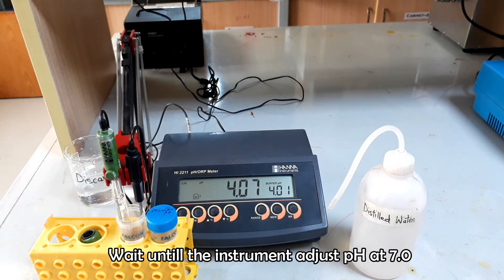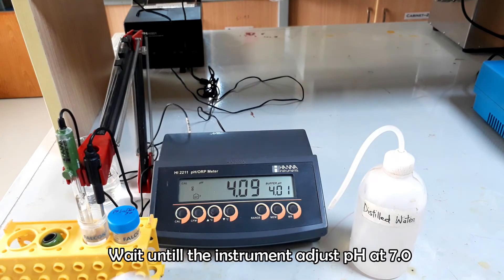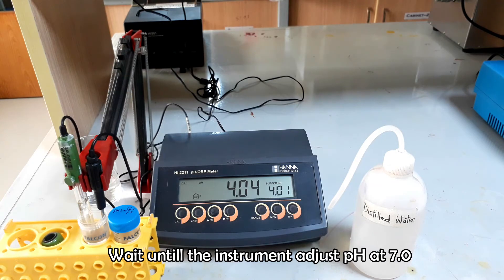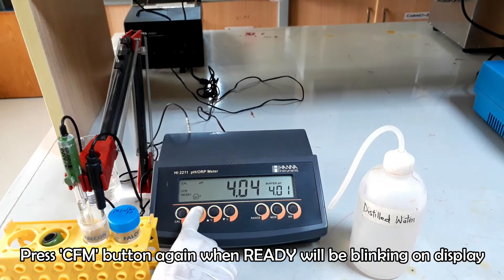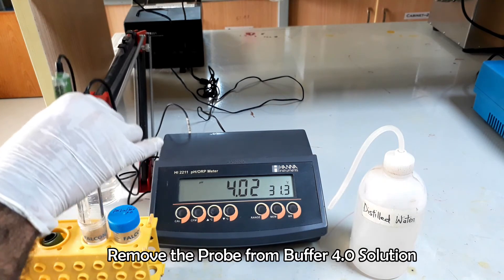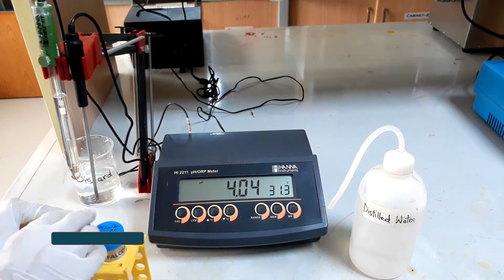Wait some moments to see the blinking of the ready word on the display. Once it is shown, press the CFM button to adjust the pH at 4. Calibration is done.